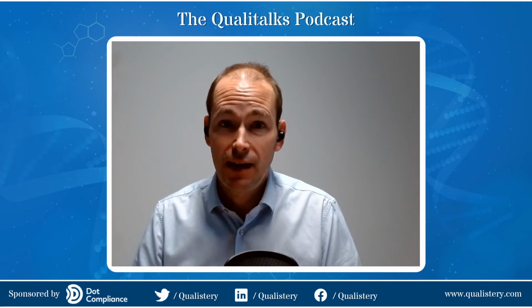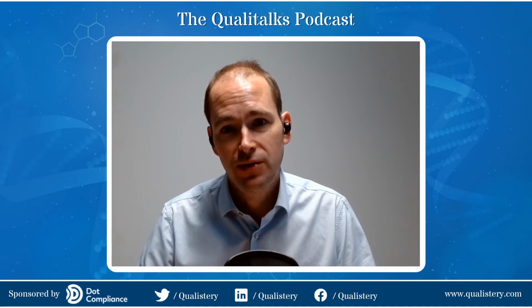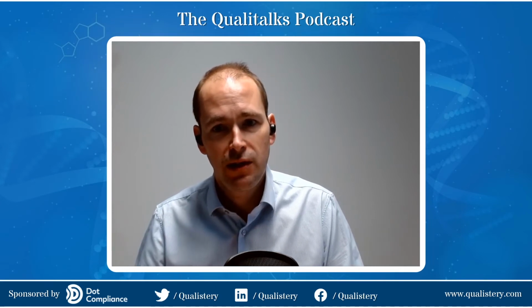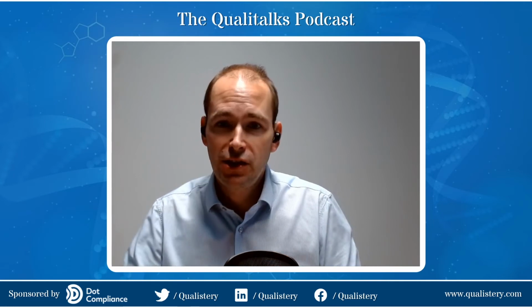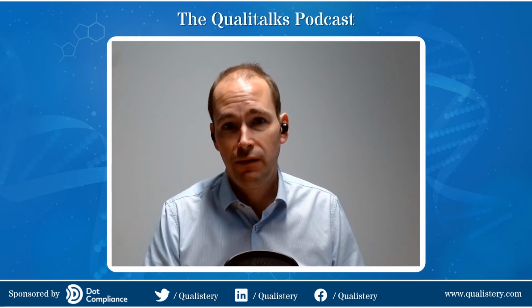So we need to start thinking then about the vacuum pump that we're using. We need to think about how we can control the rate at which vacuum pulses happen on the autoclave. We need to think about how we're going to remove any excess moisture, about how we can keep heat within the load during the cooling phase to flash off any potential residual moisture at the end of the cycle. So there's quite a few complex issues that can be addressed with a good URS at the very front.